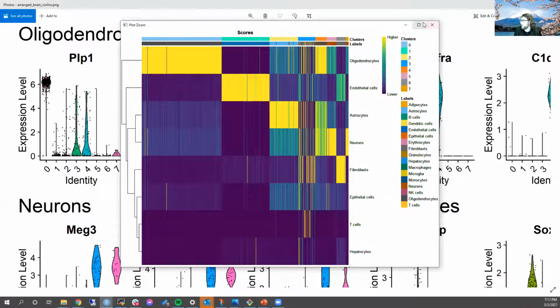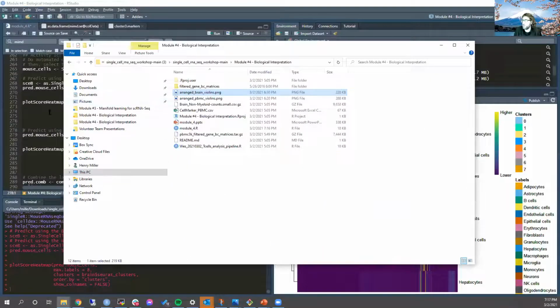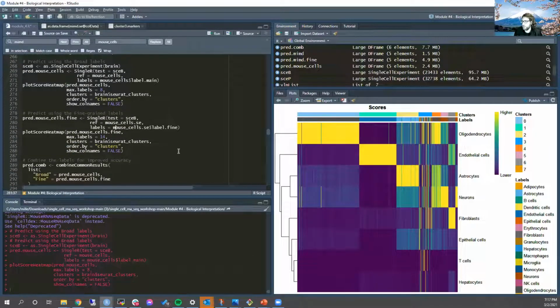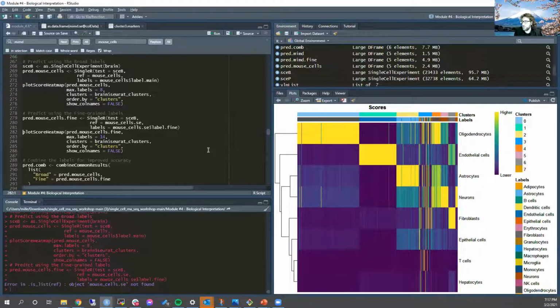And we can go through it, but I'm going to just do the fine-grained, and then I'm going to do the combination so that we can save some time here. So let's go ahead and do our fine-grained.